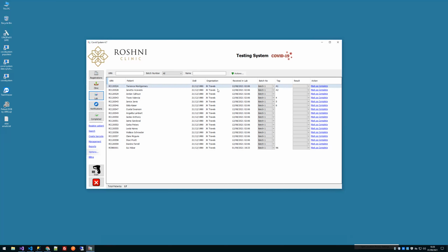And it's at that stage where they might come back and say, okay, they've put all the 17 tests in this case, they've all gone in and they've all come out negative, for example, or one of them has come positive. So an easy way to do that is to mark everything as negative. Everything is negative apart from one of them that turned out to be positive or inconclusive. I mean, people have got different terminologies for these, but inconclusive is because of something wrong with the test kit or something wrong with the sample or whatever.